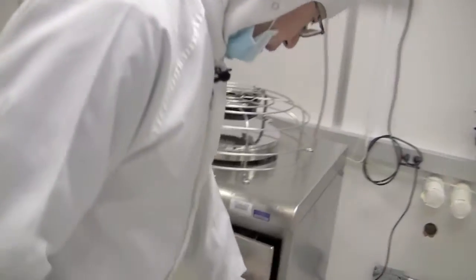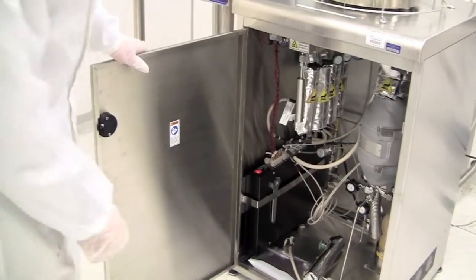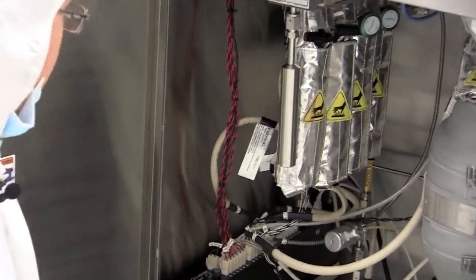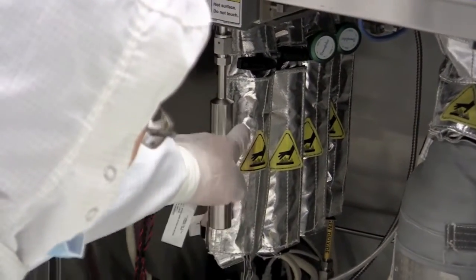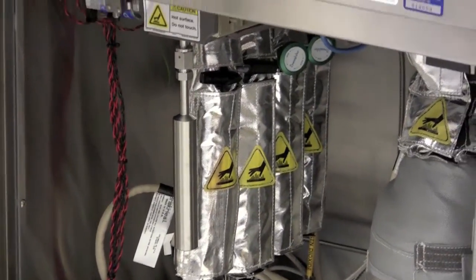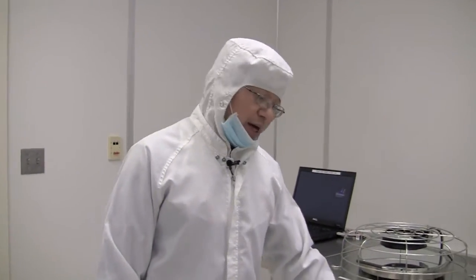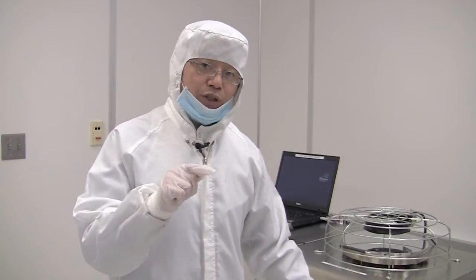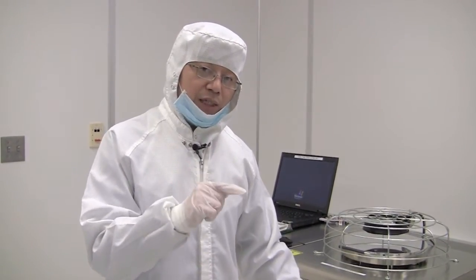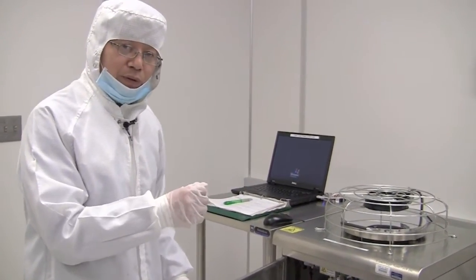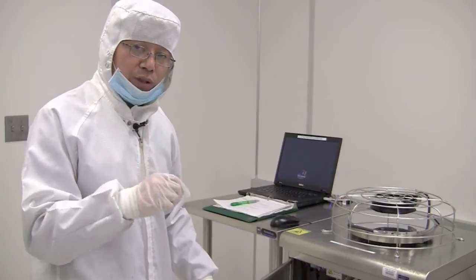Here, inside the cabinet, are the precursors for the high-k materials. One is for hafnium oxide and another one is for aluminum oxide. The one for the aluminum oxide is pyrophoric. That means it will ignite when exposed to the air. So please close the valve and open the valve gently when you use it.